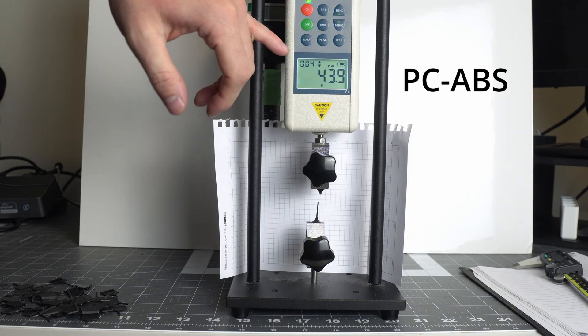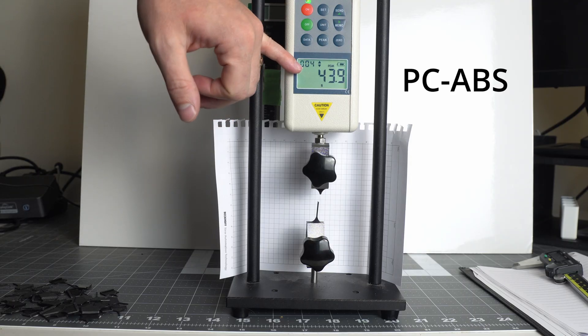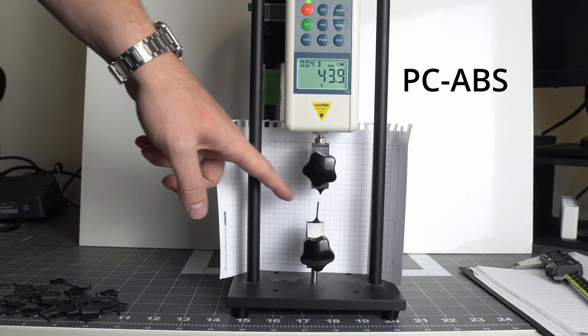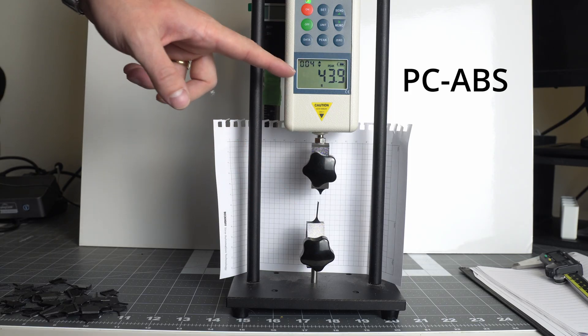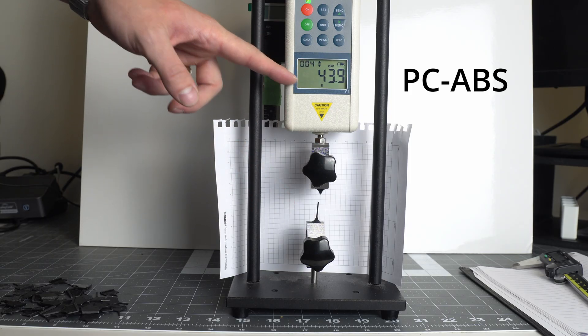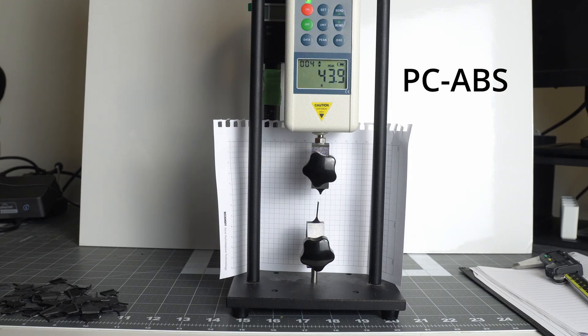43.9 and that's very close to the data sheet's 40. When we adjust for the actual cross section we get down to 39.5 on average across the 10 samples that we did.